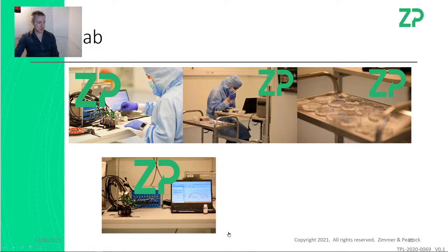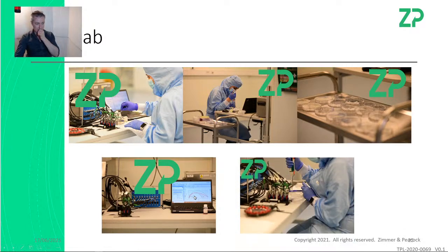instruments. In the background there, I can see that we're doing EIS. And we have jigs that allow us to mount multiple sensors at a time, so we can come around to testing them very quickly. It's probably worth saying about the robotic systems. Here I'm only showing you our manual effort, because depending on scale, the effort can be manual or it can start being robotic. But this is the kind of environment and setup you really need.